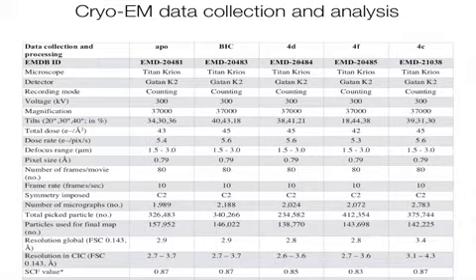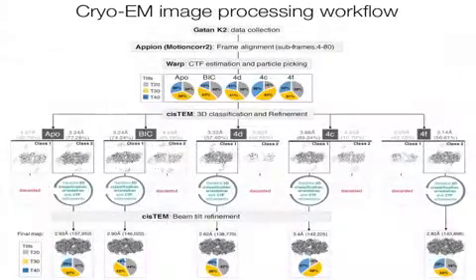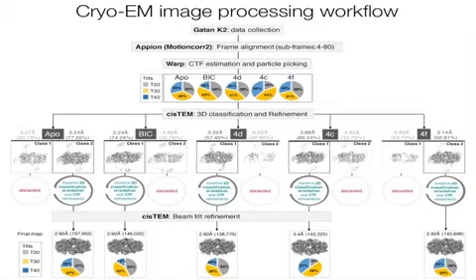And these maps were on average resolved to 2.6 to 2.7 angstroms within the active site, which is where INSTIs bind. The one exception was compound 4C, which was slightly lower resolution. So, as with any other sample, we used a fairly comprehensive strategy for cleaning the data. We used MotionCor2 for movie frame alignment, Warp for CTF estimation and for particle picking. And then we moved directly to 3D classification and refinement. We actually deliberately skipped the 2D step. We found that 2D classification tended to weed out good particles that actually had a positive contribution to the resolution of our final map, so we skipped that step.